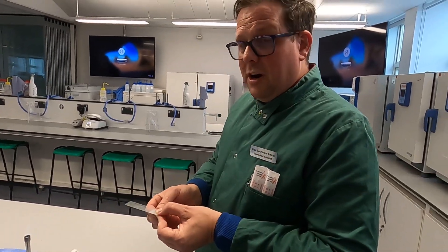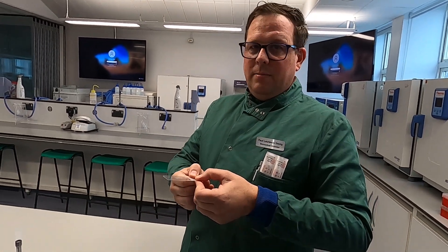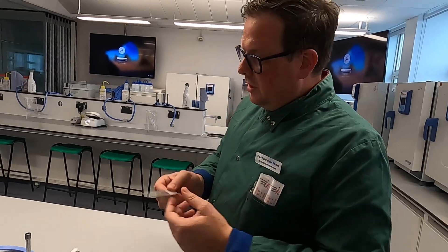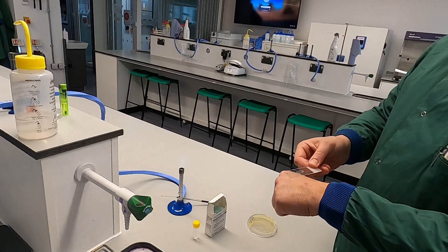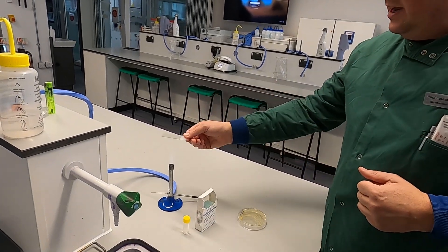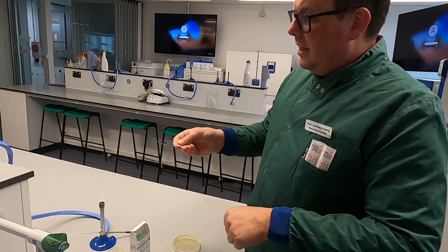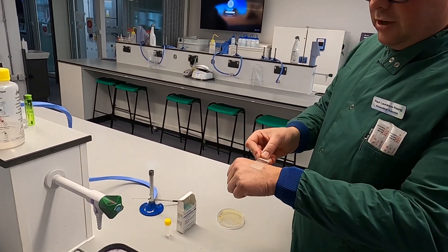Now this needs to be dry. Two options — one incorrect and one a much better idea. The incorrect way is to wave it around; that just spreads bugs. Use your flame, pass the slide gently through the fire, and test how hot it is on the back of your hand. That will make sure you don't burn anything including yourself.